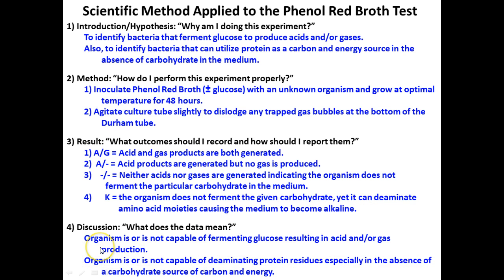So, what do we find out about our organisms? Is it or is it not capable of fermenting glucose, right? Does it produce gas or not? Is it not capable of doing any fermentation, but can do protein digestion?